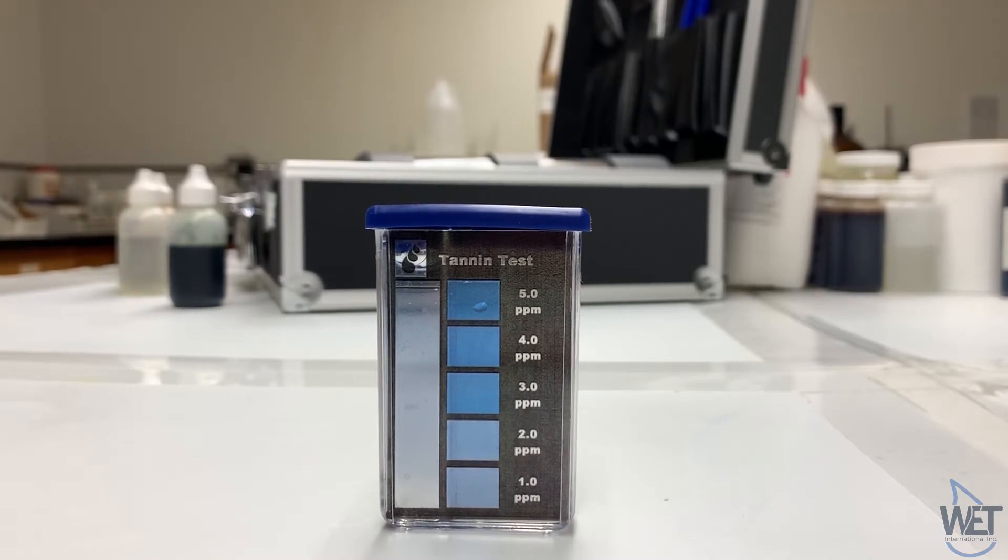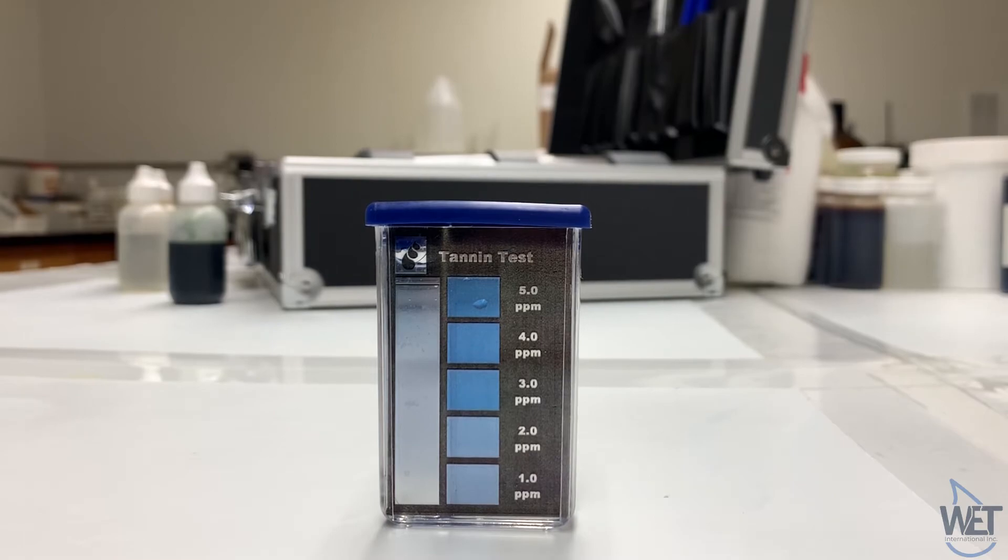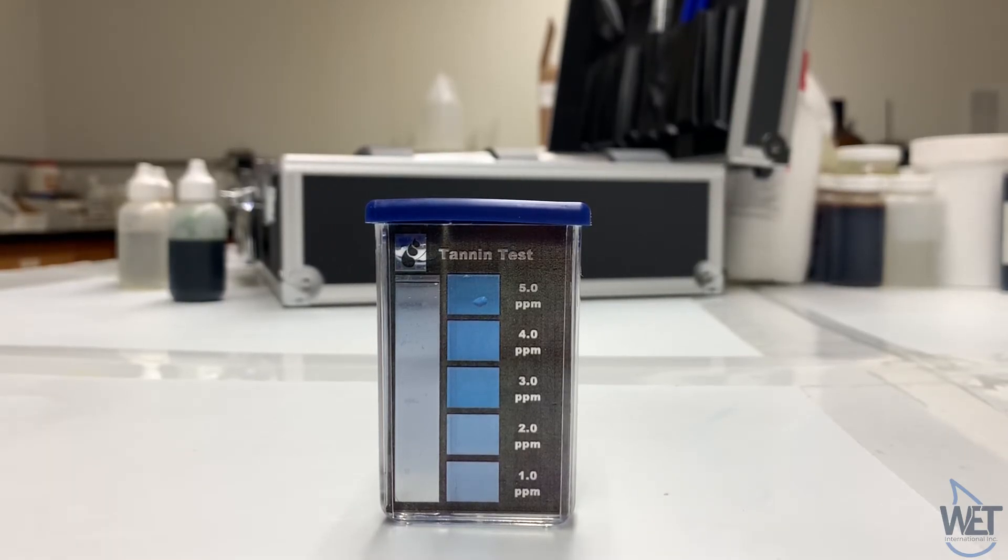After the 30 minutes, the presence of tanning can be indicated by the bluish-gray color that appears. In this sample here, it appears to be approximately between one and two ppm.